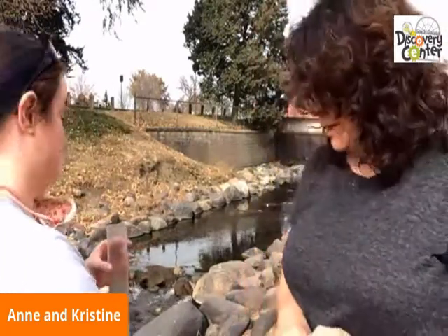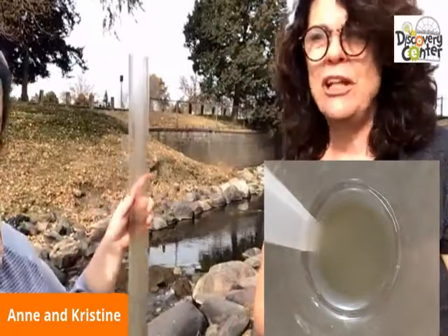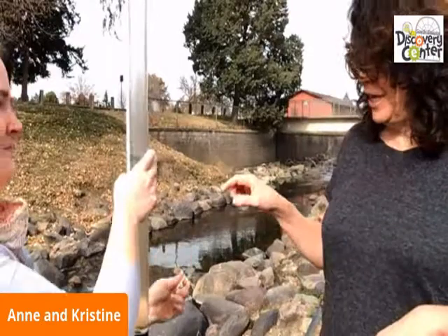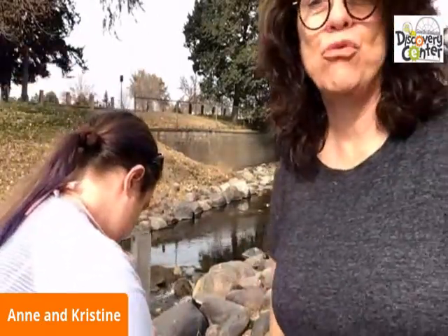I cannot. You cannot, even though we could see it through the side. We'll put in some footage later that you can look at to see how that changes. So what we're going to do now is Chris is going to hold it and look down. We're going to open the clip on the shunt, and she's going to watch it drain.